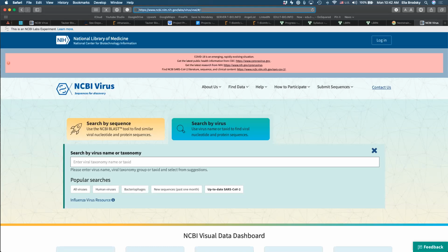So please follow along with me, right? I'm just going to share a few steps. They're simple steps, but they require you to make decisions along the way on what exactly you are going to be looking for, okay? So please follow along and tell me if you don't understand a specific step or you don't know where we are, so we can stop and address any of that confusion. Okay, so did everyone get to this page where I am on NCBI?